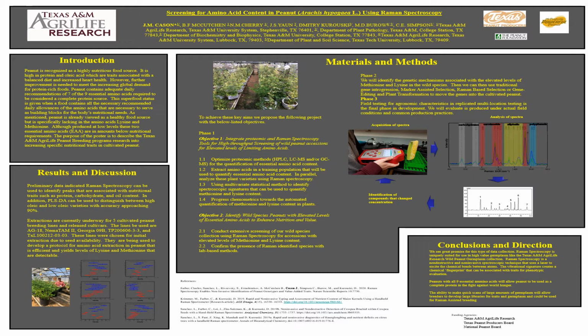To achieve these goals, we will conduct our research in several phases with objectives in each phase. Objective 1 in phase 1 is to couple lab-based proteomic techniques with Raman spectroscopy that will eventually allow us to screen our wild species collection. We will quantify essential amino acid content with these lab techniques such as LC-MS, and then use statistical analysis to identify methionine and lysine signatures using our Raman spectrometer.